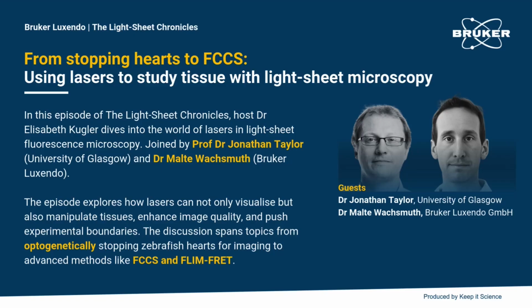Thank you so much for that wonderful summary, Malte. As a biologist, I know there's so much maths and physics involved. And I know I've done FCCS with you myself for my master's thesis many, many moons ago. And I remember we needed a lot of prior knowledge as well, right? About dwell times, about fluorophore sizes, migration times, etc. So that was lots of different things that we needed to really involve.